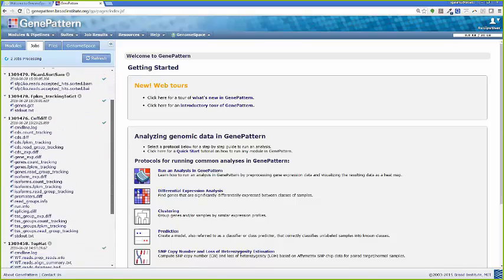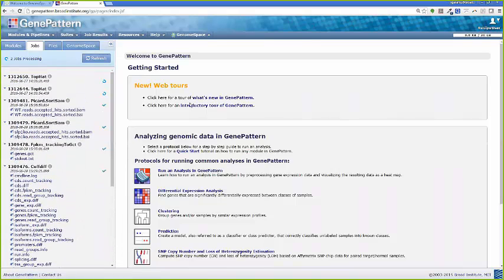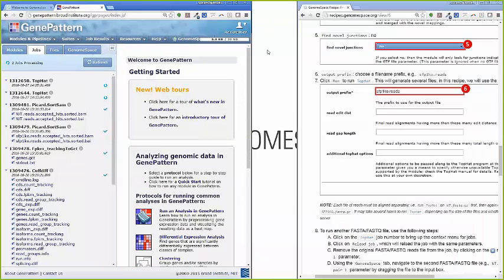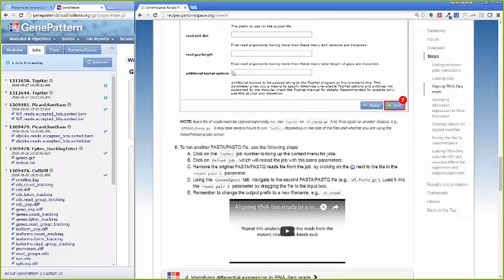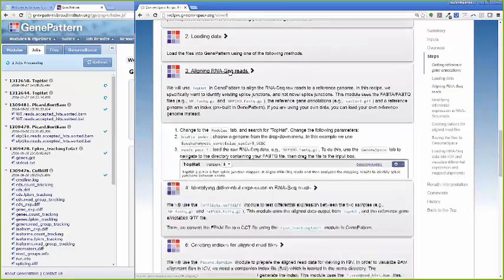And the reason that I'm showing you that is because depending on how long this takes to run, we might actually have to use those TopHat jobs. So the next steps here: now we've completed this TopHat part of the recipe, so we can collapse this.